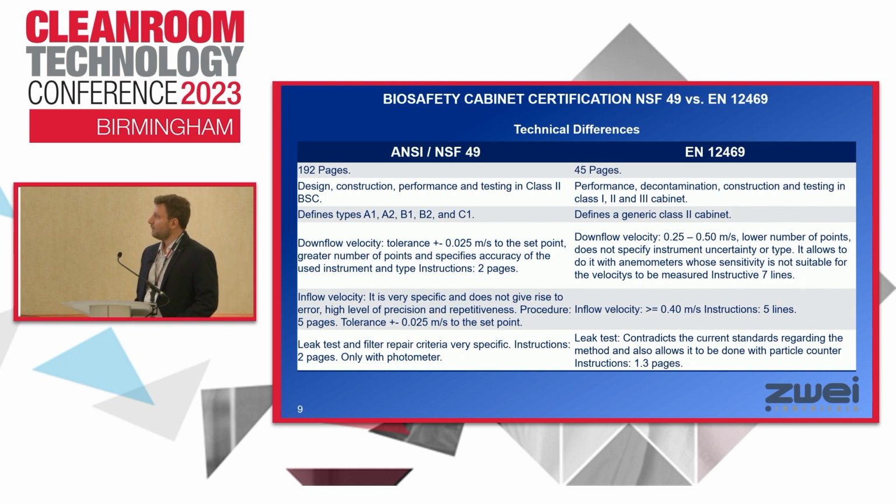Regarding the technical testing to define if our cabinet is able to be used without risk for us and for the samples: downflow test. Downflow test for NSF has a tolerance of 0.025 meters per second for the downflow velocity set point. Usually 21 measurement points or more are taken. NSF specifies the instrument used. We must use a thermal anemometer.